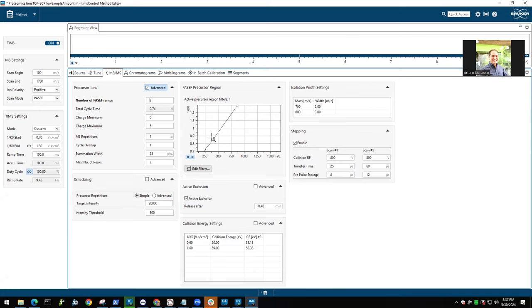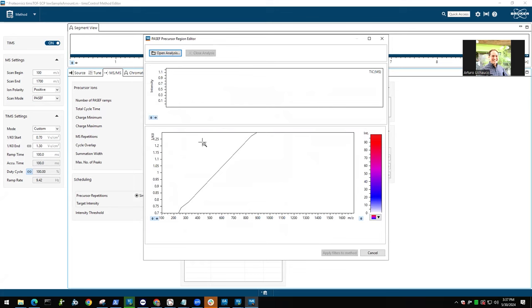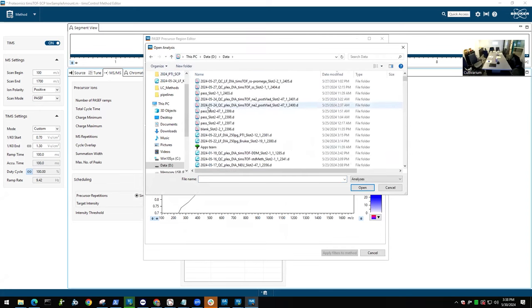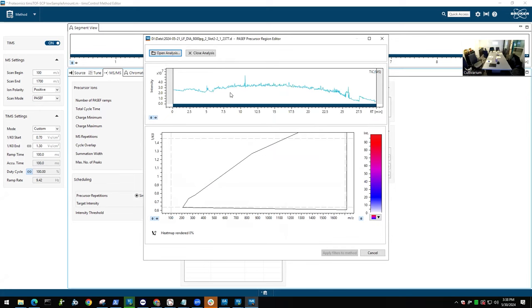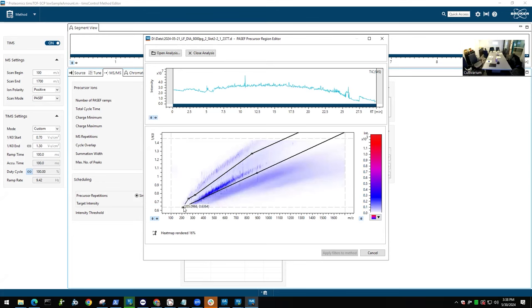And in addition, what I did as well, I've changed the polygon. Not sure how familiar you are with the selection polygon for precursors. But again, based on how our ion cloud is positioned, depending on our ion cloud, most of the precursors of interest are in this range. So you can say, I just want to focus on this range here. You can define your boundaries wherever you want.